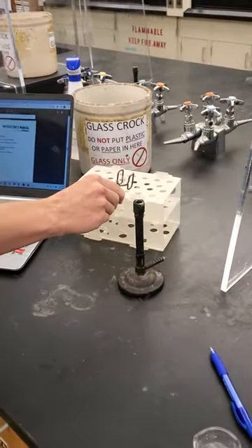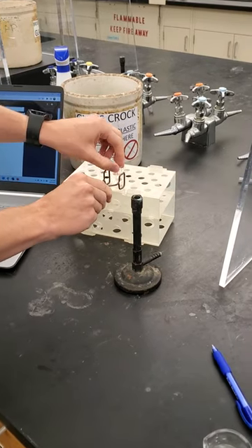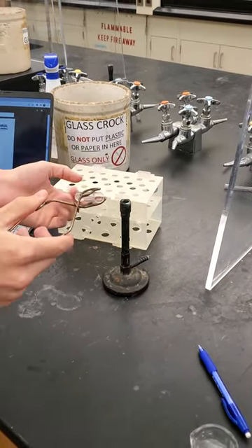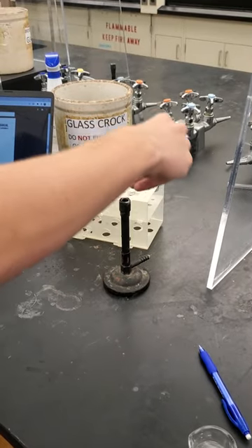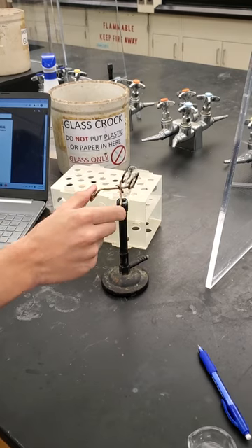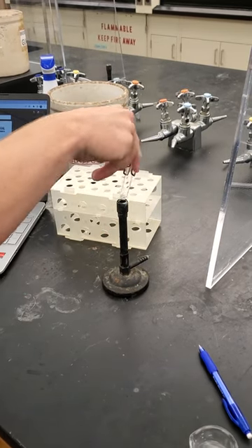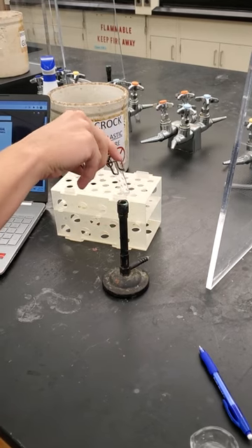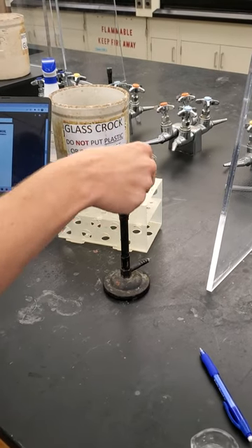So you want to get your test tube ready. And then there will be a fire. You just want to heat it around and move it so that it doesn't burn in one spot. But you want to make sure the opening is avoiding people — sometimes you never know what's going to happen, so you might shoot it out.